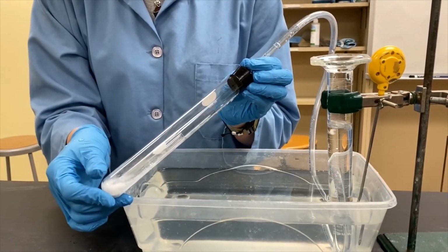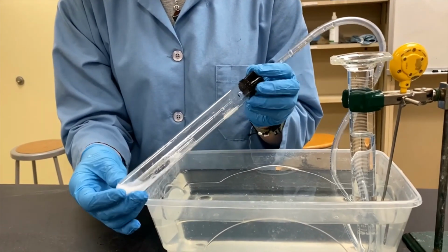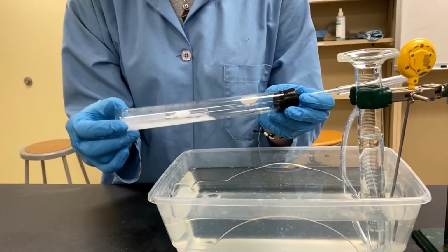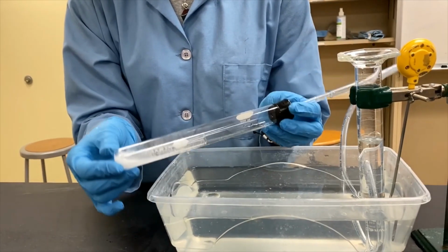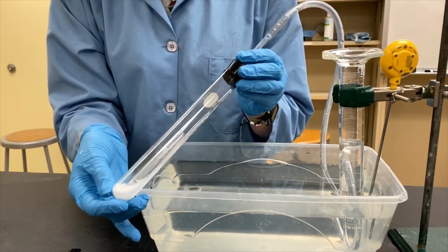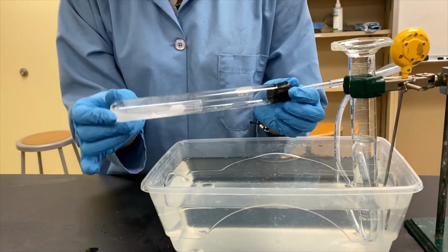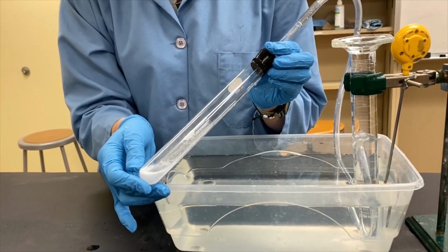So I'm just going to keep tilting this back and forth until all of the calcium carbonate is gone. If we do not dissolve all of the calcium carbonate, our calculations are going to have error. So we want to make sure everything reacts.